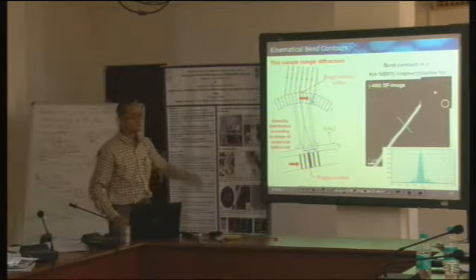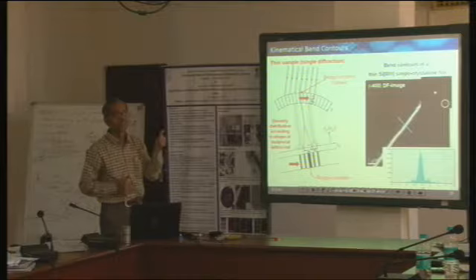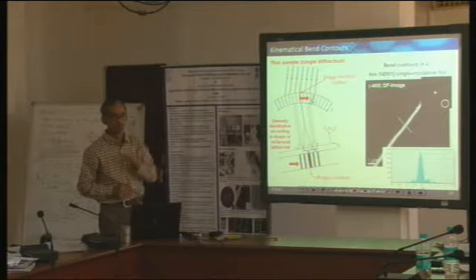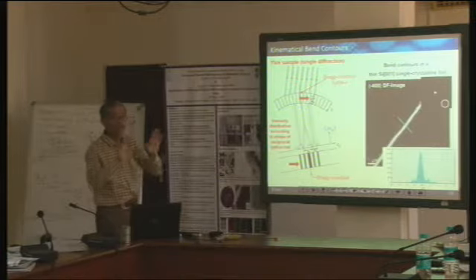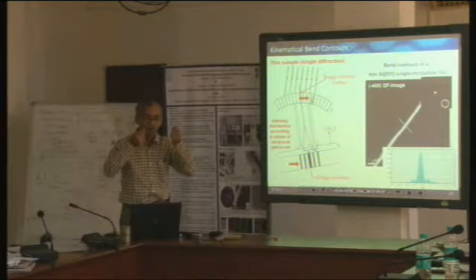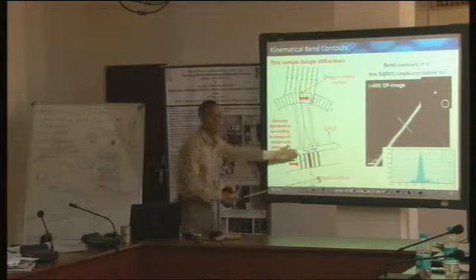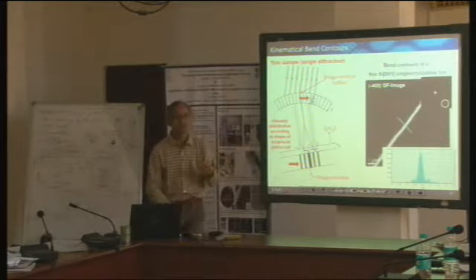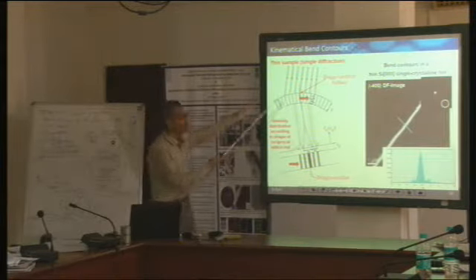But this holds good when the sample is thin. If the sample becomes thick, then this doesn't hold. It doesn't hold good in experiment. According to our kinematical equation, it holds good at all thicknesses. This is what it will show, isn't it?